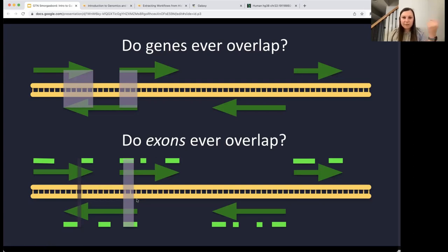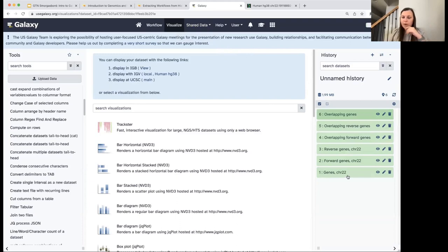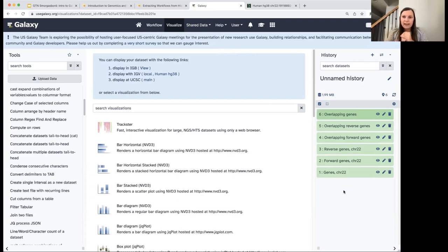Do we have to start from scratch for this new question? Thankfully, no. We can do this in Galaxy using workflows. We did all these steps: brought in the genes, extracted forward and reverse strand genes, checked for overlaps, and got a list of overlapping genes on both strands. Now we want to run the same analysis on exons instead of genes. The way to do that is using workflows — we don't have to redo all the work.